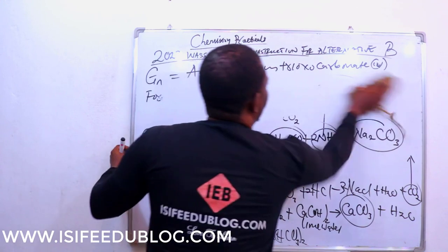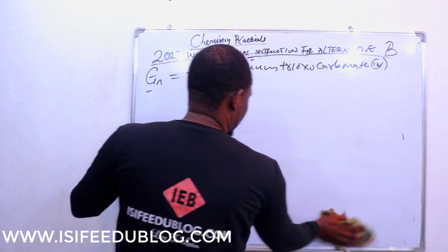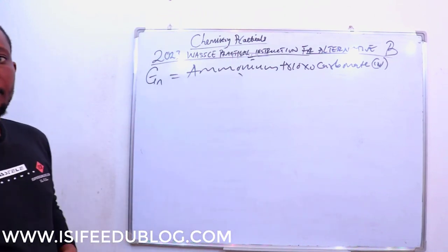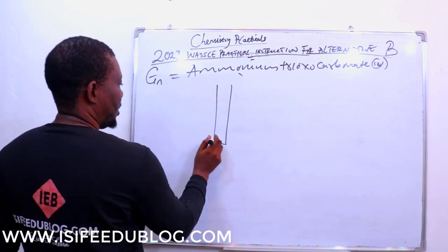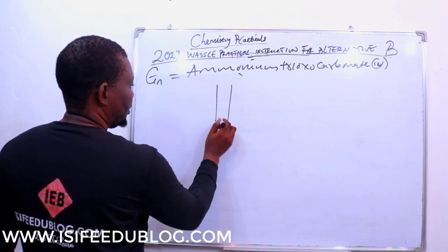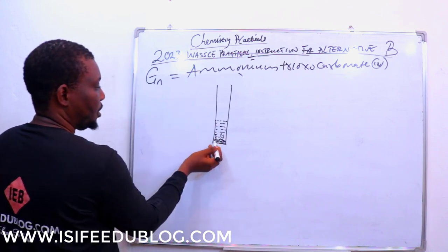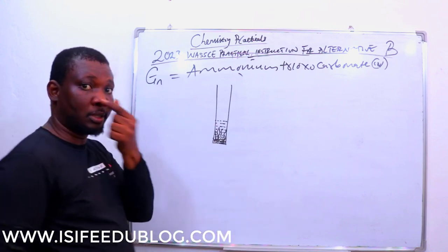We are looking at a scenario where we want the salts to first be dissolved in water, then divided into two. Suppose this is a test tube. You are asked to add a small sample, just as small as this, and then add about 10 cm³ of water. Then shake to make sure every part at the bottom dissolves. Of course, all will dissolve because the salt is soluble.